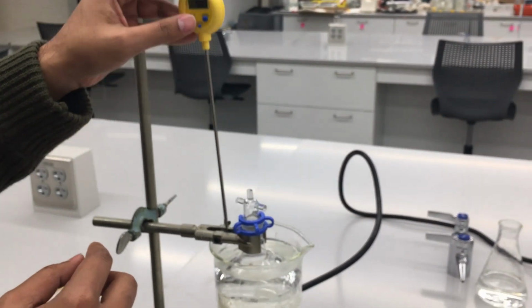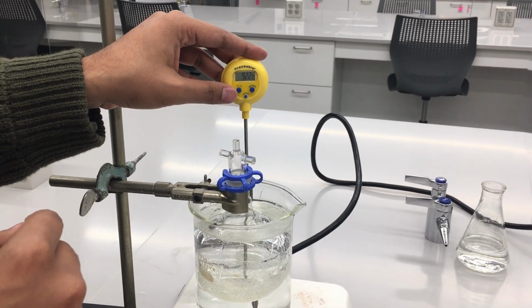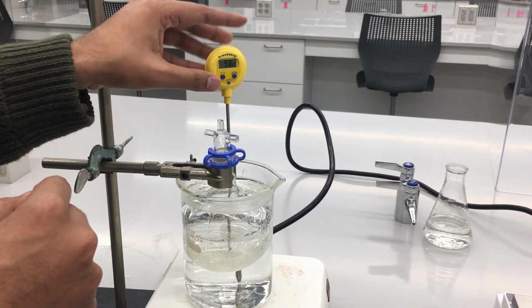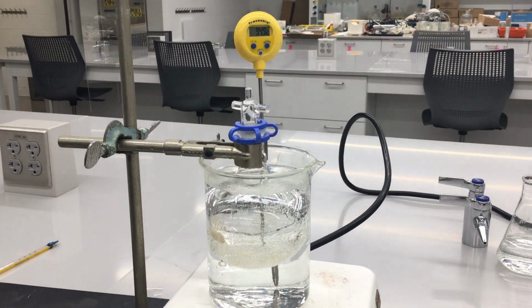And all this time, or near the boiling point, I'm going to find the actual temperature of this boiling water. You stick the thermometer in there. You see it's about boiling temperature. It's close to 100 degrees Celsius.